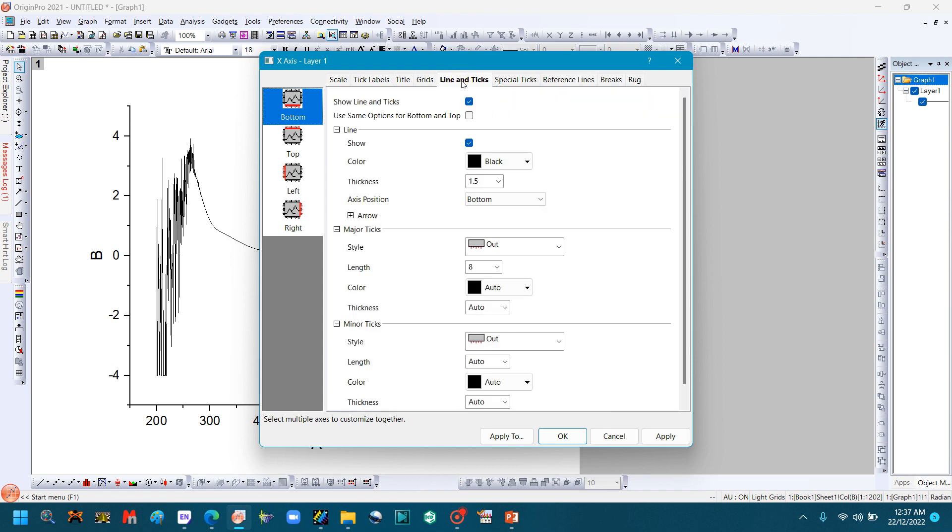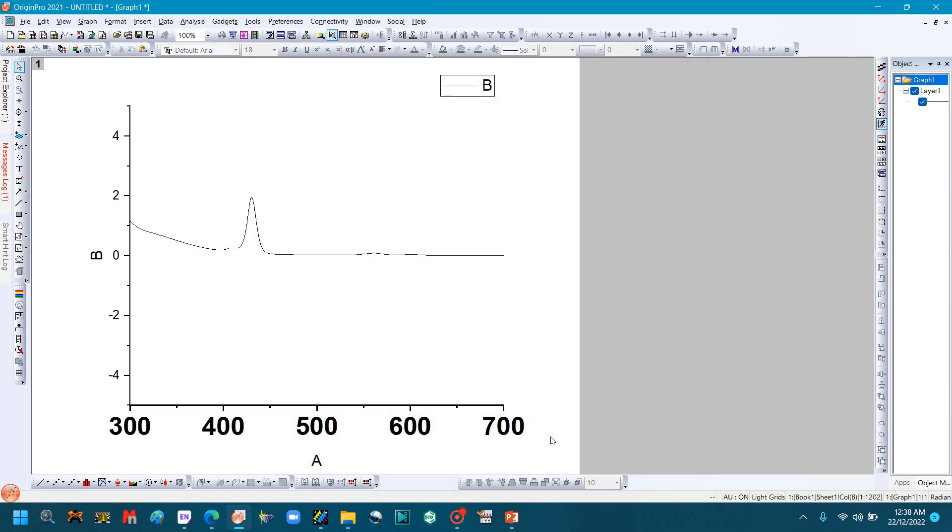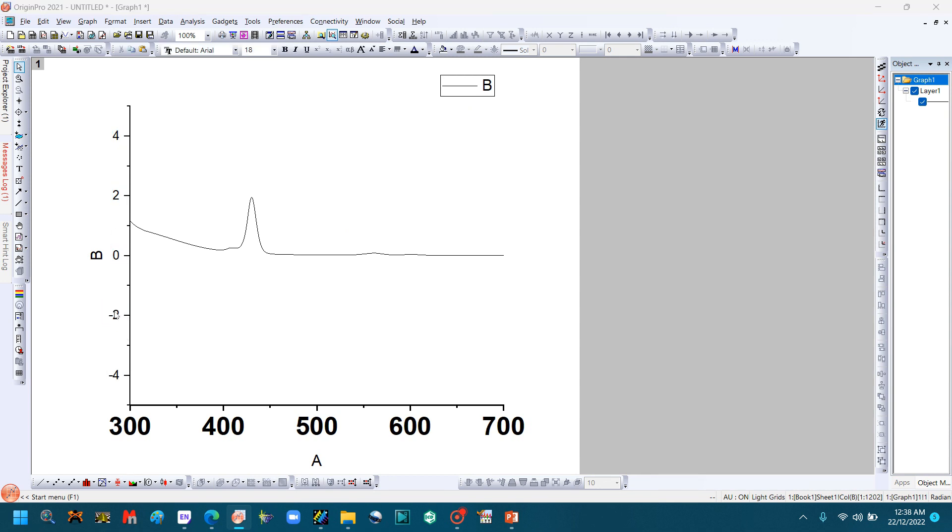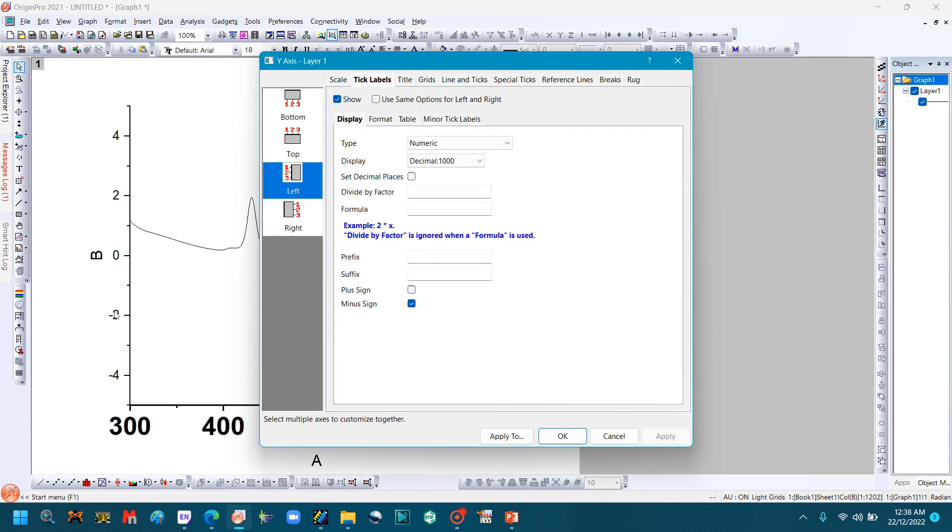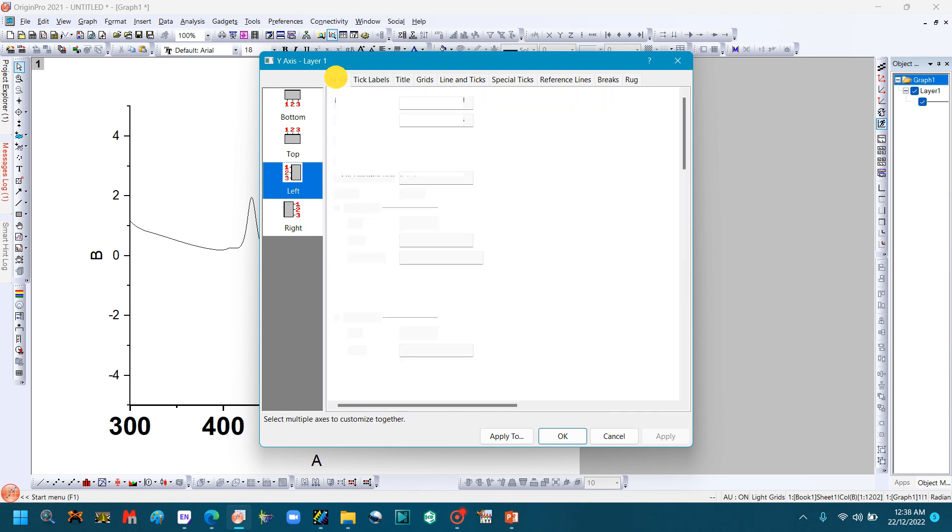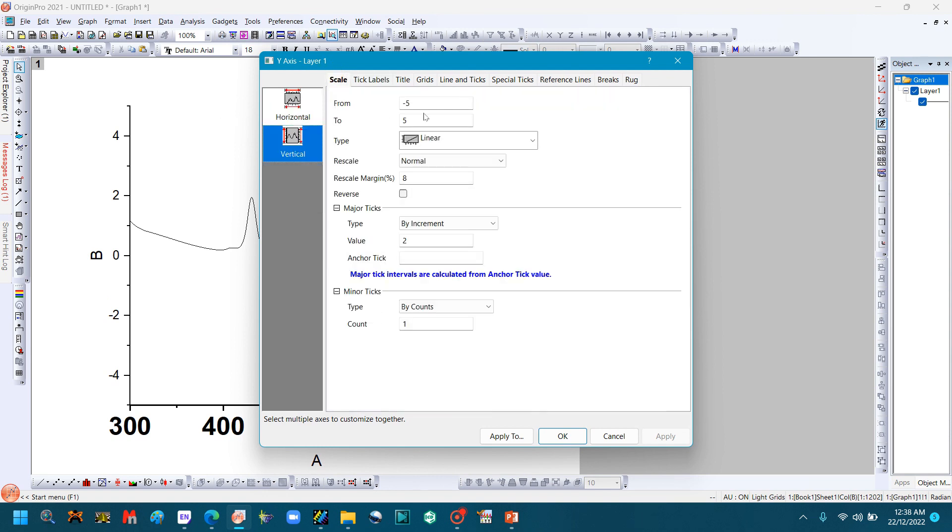Go to Thickness, select 2, and press OK. Similarly, we will change the y-axis. Double-click the y-axis. Go to Scale and change the scale according to your choice.